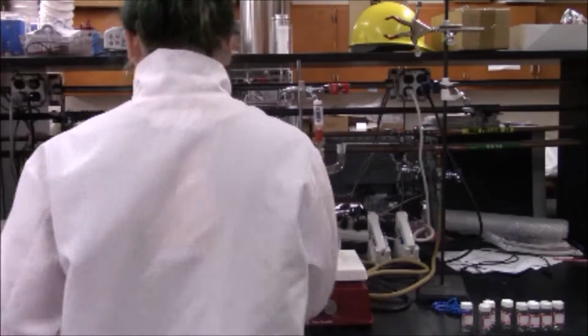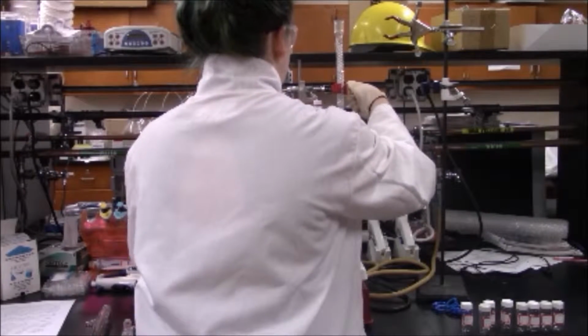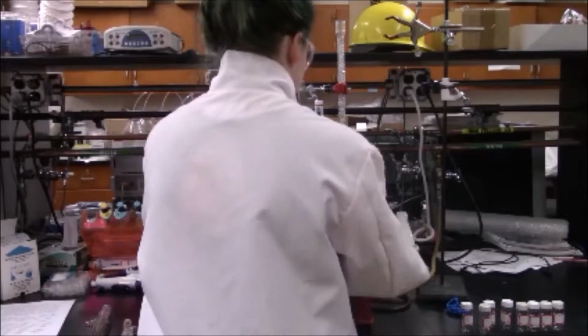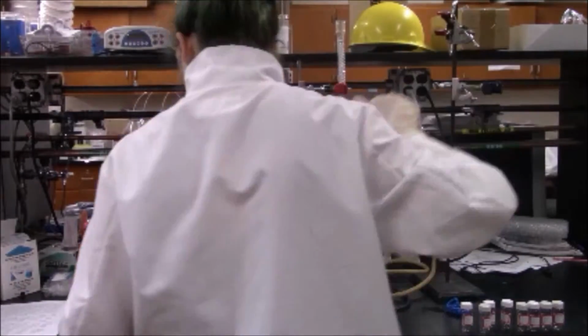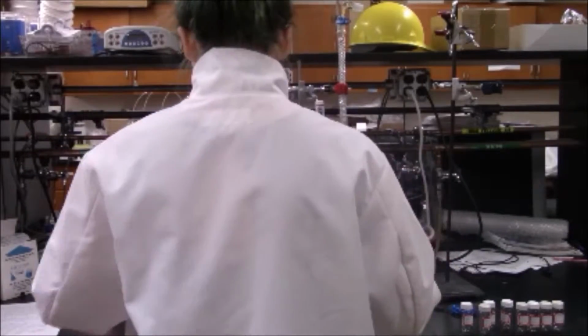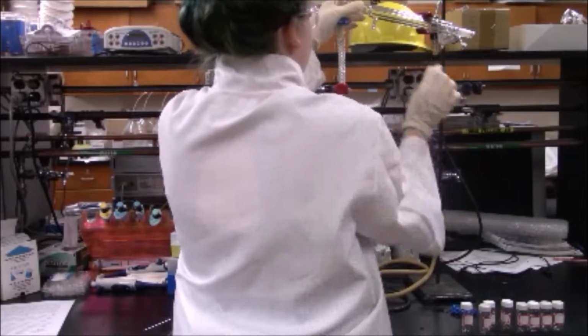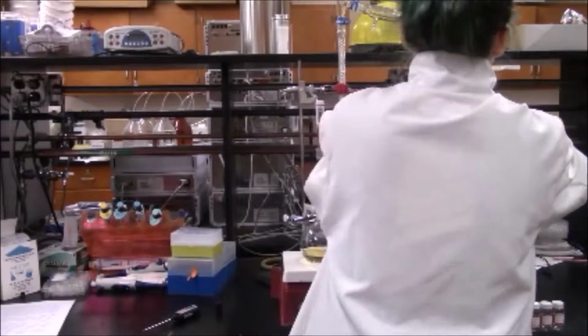As batch distillation proceeds, the liquid in the bottom flask becomes depleted in ethanol, and eventually nearly all ethanol will be separated and condensed from the top of the column. At the end of distillation, the vapor should be pure water. This procedure demonstrates the process of distillation. In actual biofuel production, the fermentation broth would be distilled to purify the ethanol that was produced.